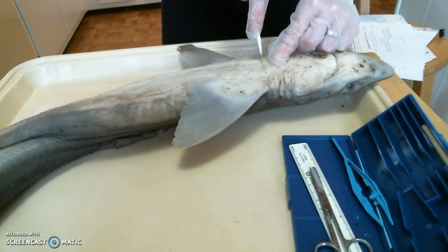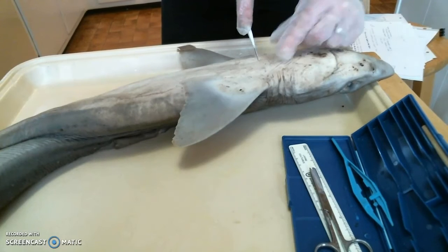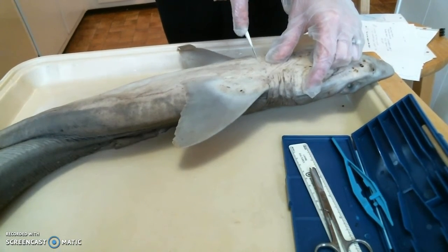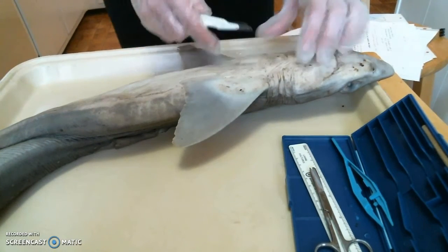Okay, it feels very hard right here. I don't really know if I'm cutting too deep or not deep enough. My blade almost seems a little dull.